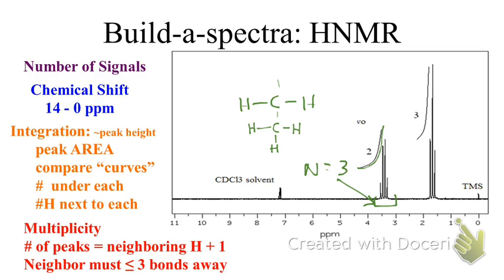Why do we pick the simplest way first? Because it's the simplest. Okay? It is as simple as that. Okay? So in this case, we now have our 3 hydrogen neighbors for that CH2.